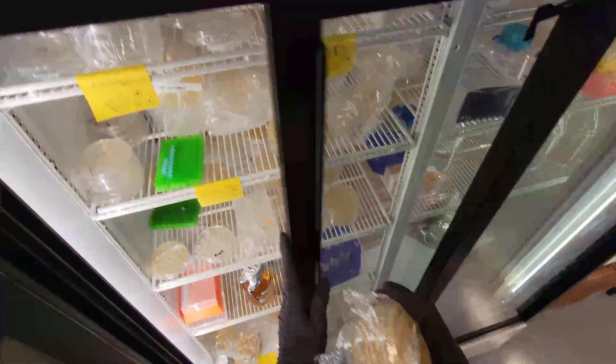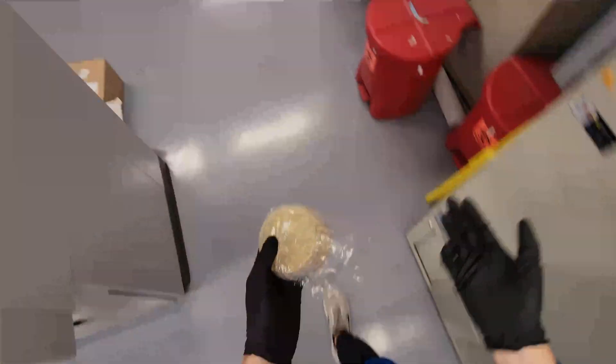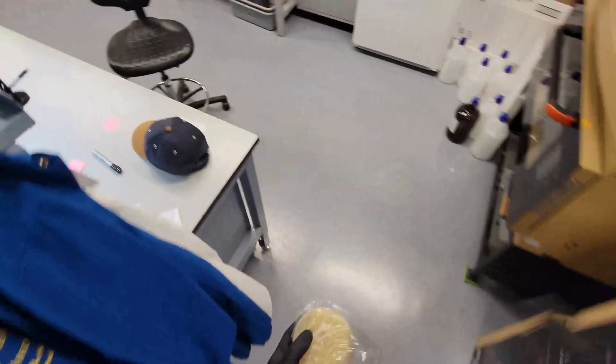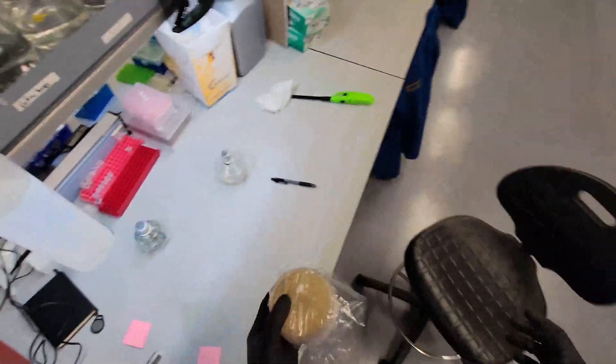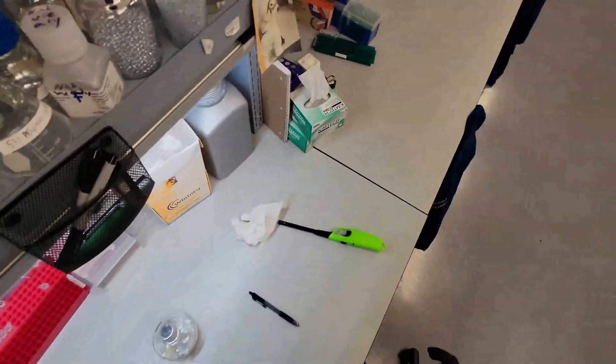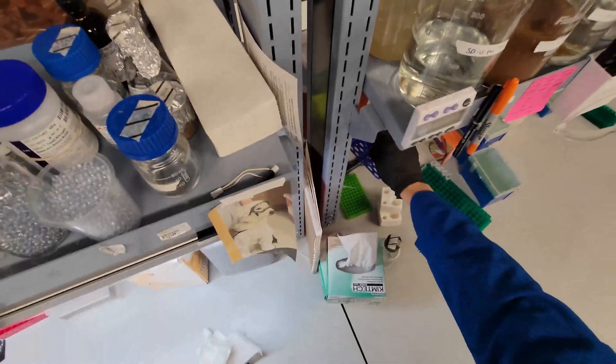Alright, I want to show you how to make overnight cultures now. So these are some strains that have been sitting in the fridge. Ideally you want really fresh cultures that have just grown, but it's really not that big of a deal. They can stay in the fridge for like a month.